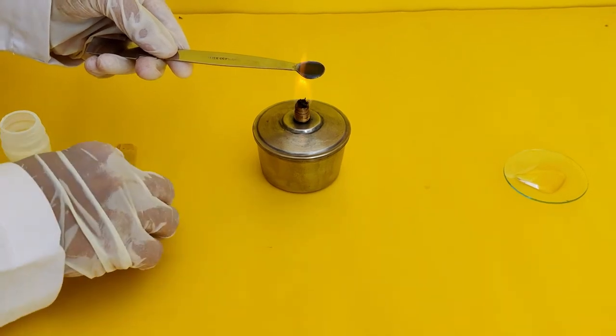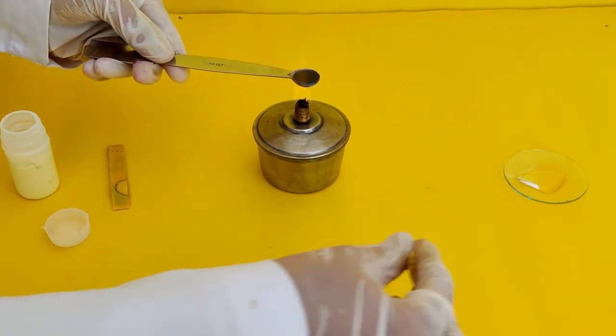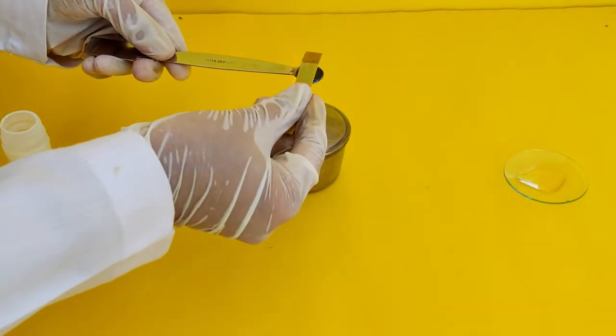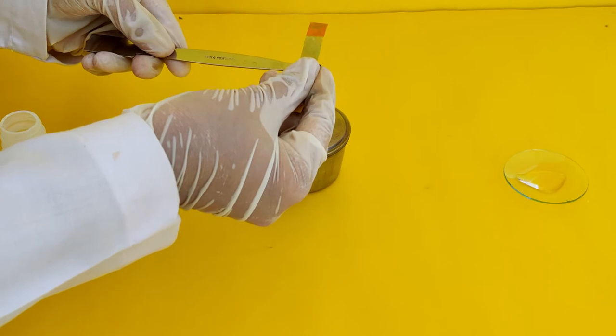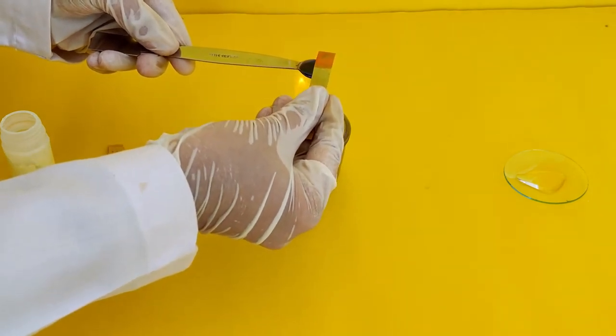Take a pH leaf and wet it slightly with water. Hold the pH paper over the spatula. Be careful not to take the pH paper very close to the spatula.